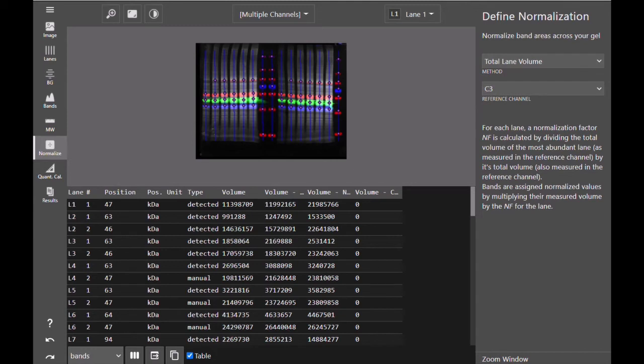The volumes of the proteins of interest in all other channels are then multiplied by this normalization factor in order to determine the normalized volume.